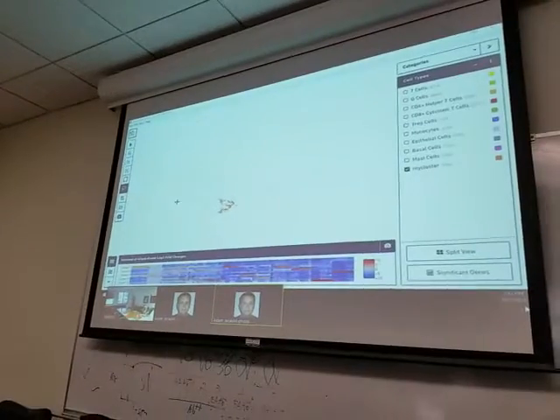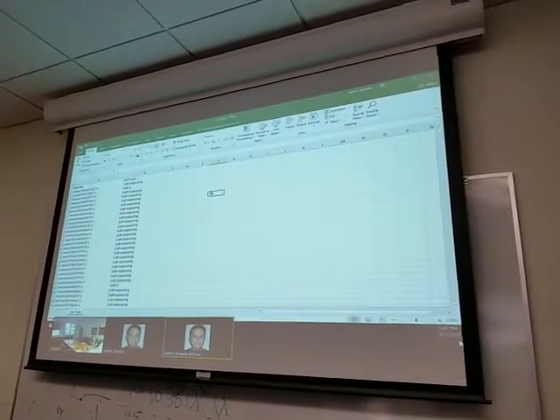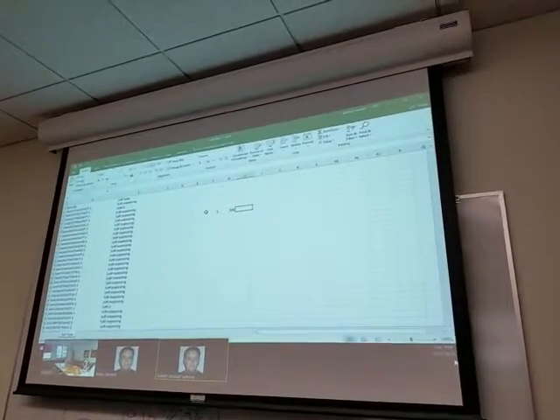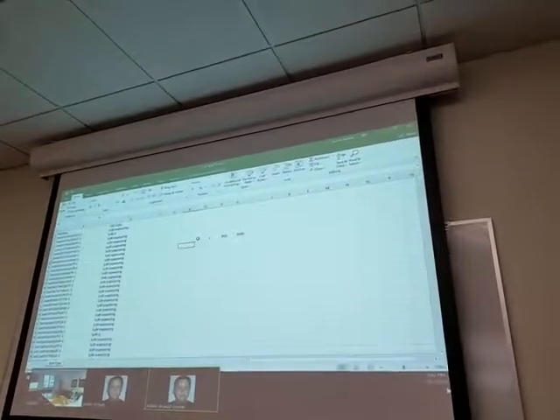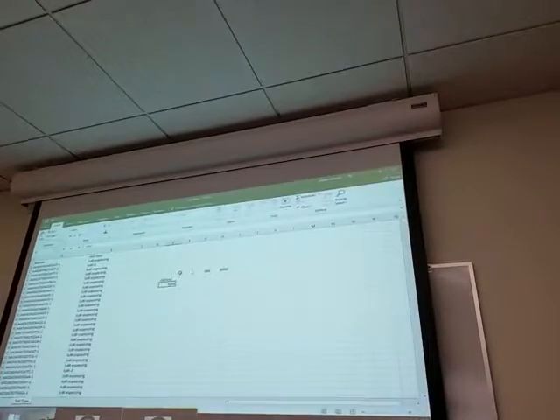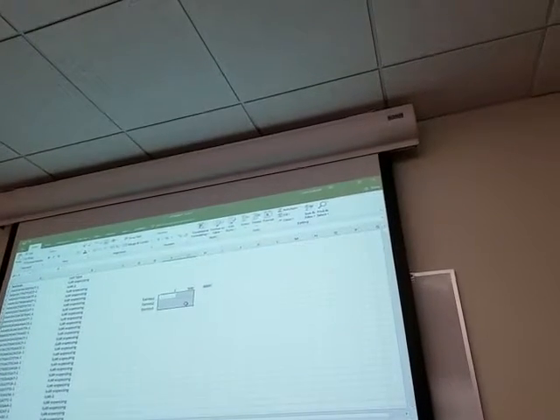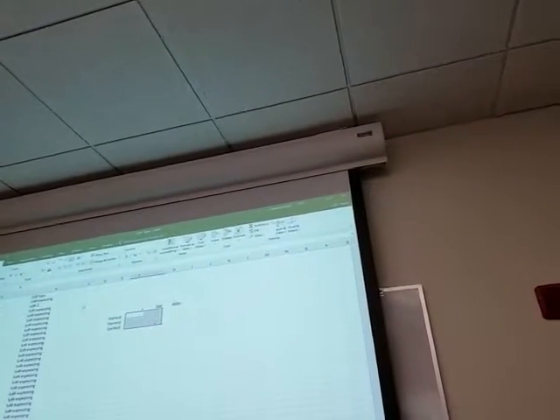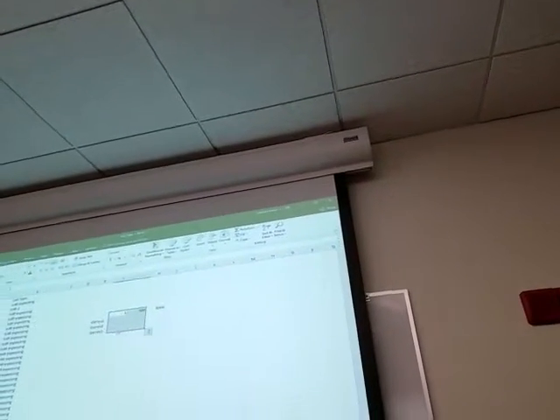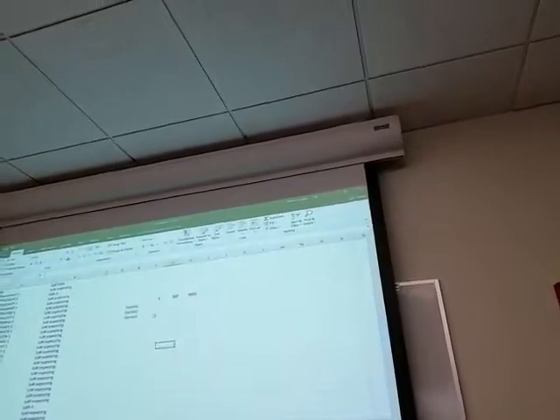out. Is that clear? Well, so I think what you're saying is, my master table has barcodes out to 8,000. Right, and I've got genes down there. And you're saying I want just this subset to look at. Yeah, that's right. A subset of barcodes and even a subset of genes. That would be even better. Yeah. So how do you? I mean, you can pull out.